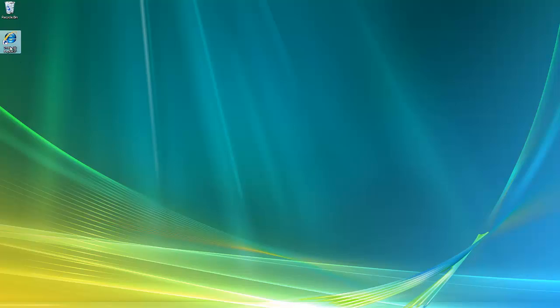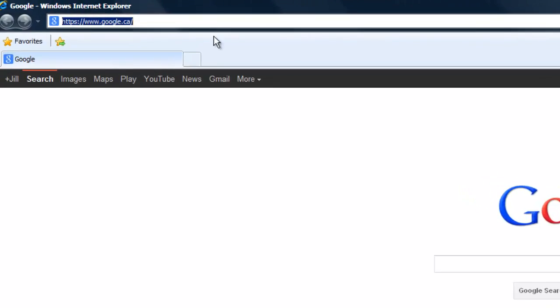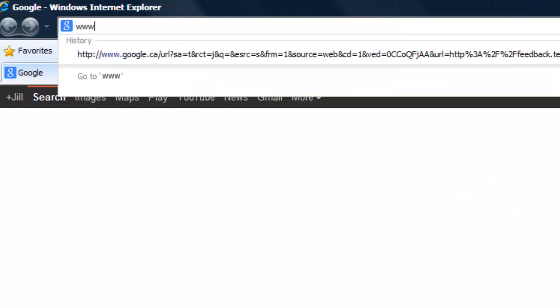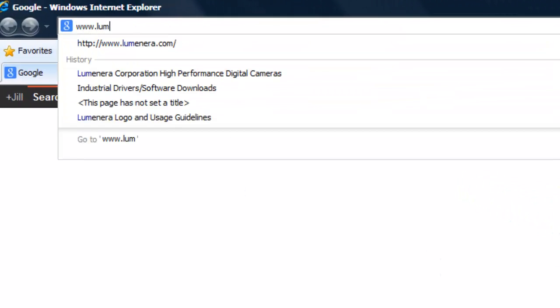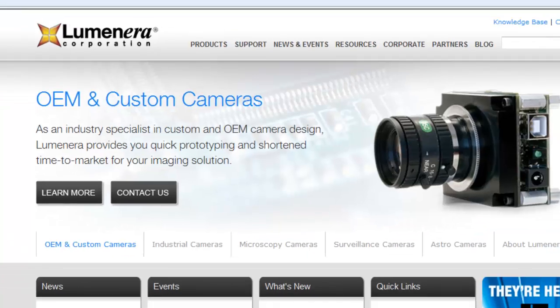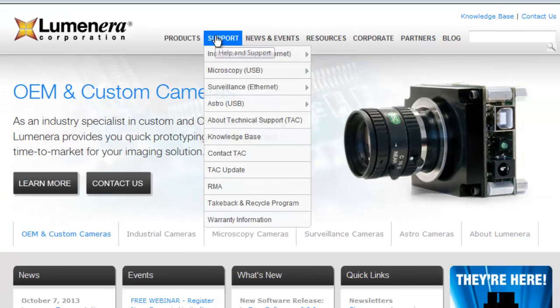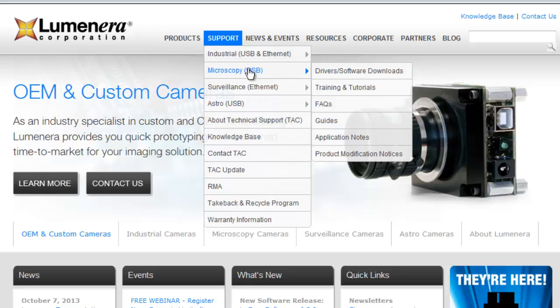Open an internet browser and type www.lumenera.com. Go to Support, Microscopy, then select Drivers slash Software Downloads.